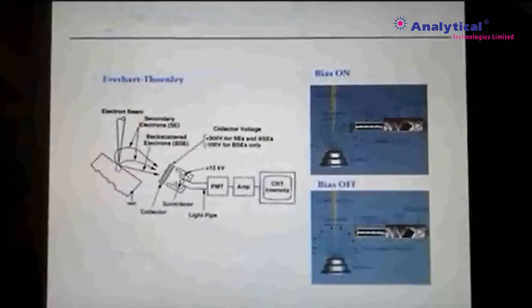According to the secondary electron detector, SE itself has a negative charge and is spread out to all around. To increase the collecting efficiency of SE, SE detector has a positive charge in the front of the detector, and the scattered secondary electrons will come near the positive charge.